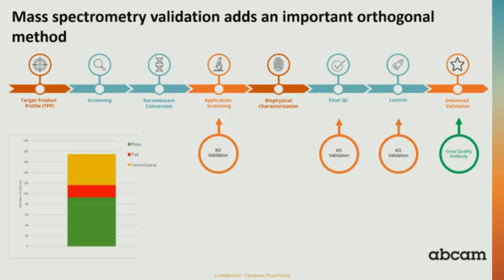And I'm sharing this because I want you to understand that it's not easy. If you're going to buy in cell lines that are genomically validated, you're going to get this result. So be prepared for it, because you have to test it and make sure you got that right. You have to understand that you've got a proteomically validated cell line before you then apply it into your antibody cascade, which is what we're doing. And we've got to get it right. And sometimes it's a really hard job.